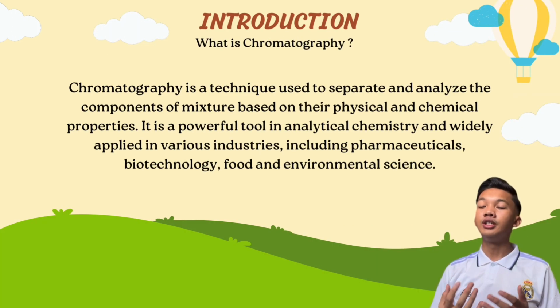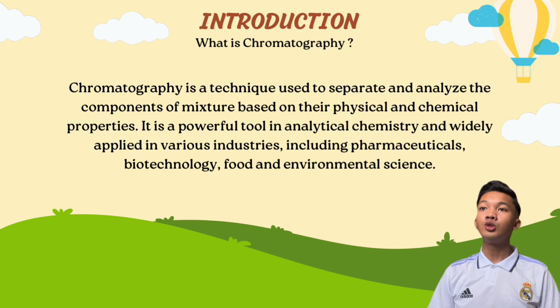So for the introduction, let me explain what chromatography is. Chromatography is a technique used to separate and analyze the components of a mixture based on their physical and chemical properties. It is a powerful tool in analytical chemistry and widely applied in various industries, including pharmaceuticals, biotechnology, food and environmental science.